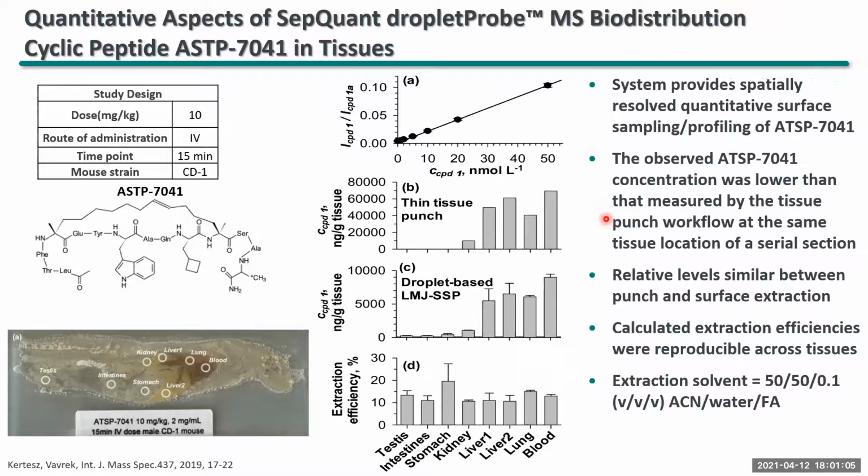Did you ever try, for instance, comparing it to homogenization of liver tissue, which is usually very uniformly distributed, and compare that to what you were getting on the droplet? Yeah, it's definitely a little bit lower. It's not going to give you the same exact quantitative amount. So when we do this methodology, we say it's quantitative, but it's probably going to be more relatively quantitative. But I'm more interested in these kinds of curves. You want the trends, right? I understand. The trends are what I'm a little bit more interested in. Yeah. Okay. Very good. Thank you.